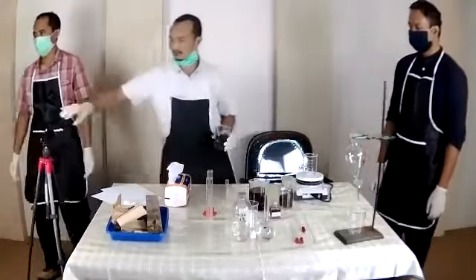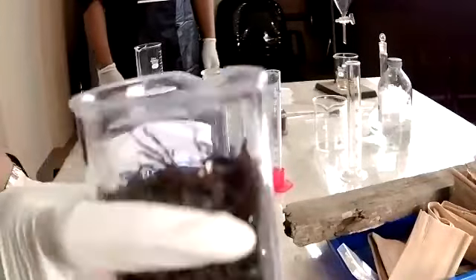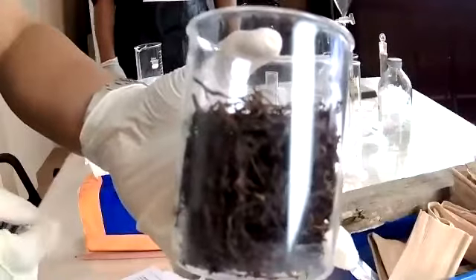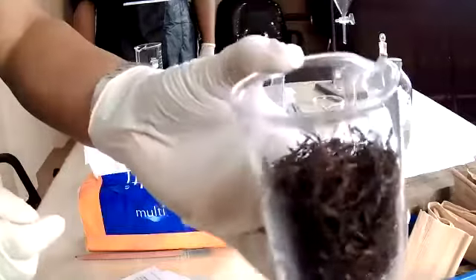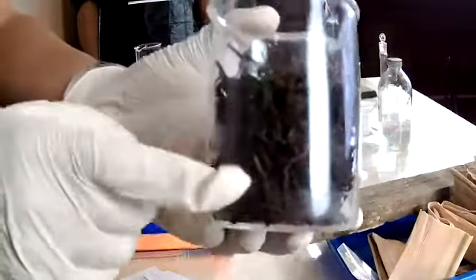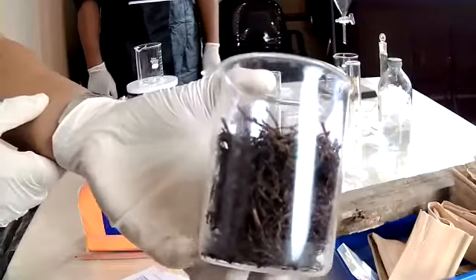So this is tobacco. This is usually part of cigar or cigarette ingredients. Usually it's your tobacco, and this is part of the ingredients when you make your own cigars, I mean.